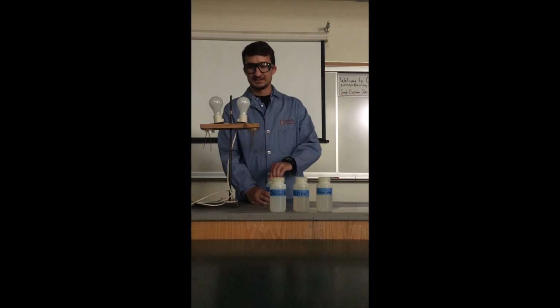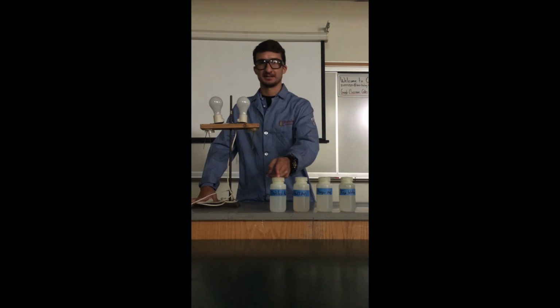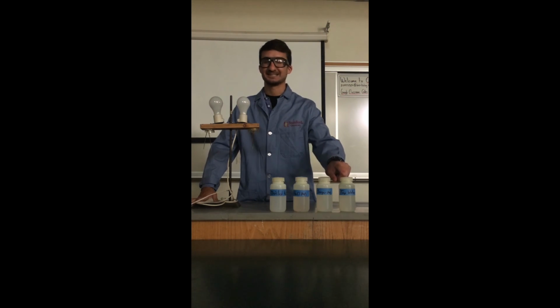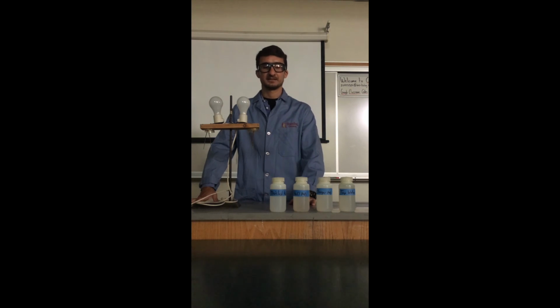All right. So, in summary, pure water did not conduct. Water with salt in it conducted very well. Water with sugar did not conduct. And our tap water, which is water, just like the first one, but it has a little bit of dissolved ions in it, conducted just a little bit. So think about the things that conducted and what didn't conduct, how they're similar, how they're different. This is conductivity of solutions.